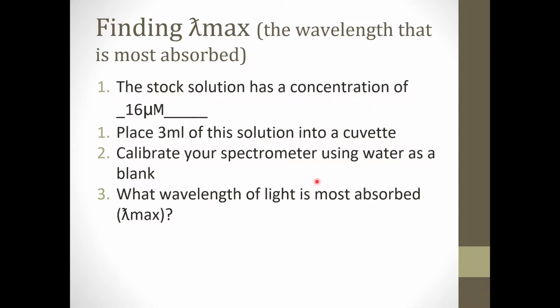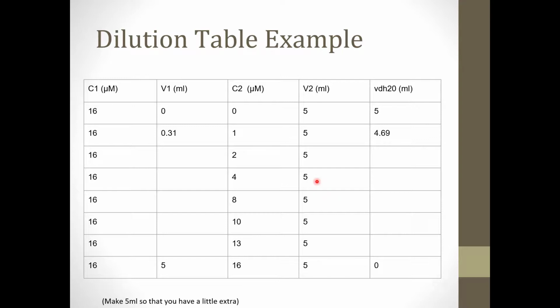Then you would put the cuvette in the spectrophotometer and hit record, basically hit collect data, and you would get a peak just like we saw in the previous slide, and you would see how much light is absorbed at that peak wavelength. And I'll have a video on that here in just a little bit.